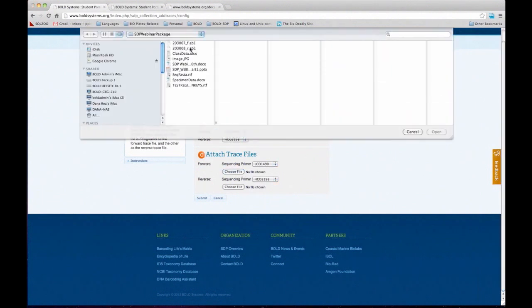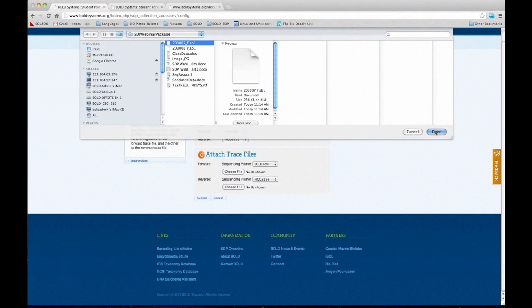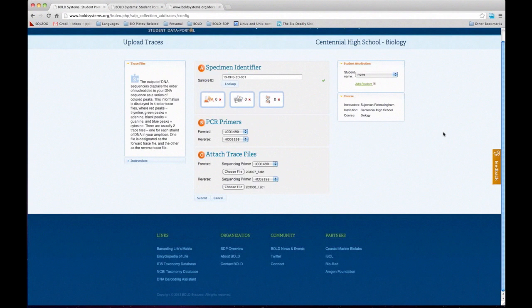I choose the forward primer, then the reverse primer. It's very important to note that you have to upload both primers together — if you only have a reverse or a forward, the system will throw an error and you won't be able to upload them. You can upload more than one trace file per record — let's say you have two forwards and two reverses, that's fine. But make sure whenever you're filling out this form there is always a forward and a reverse.